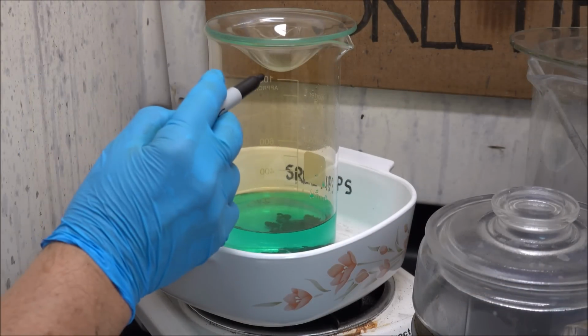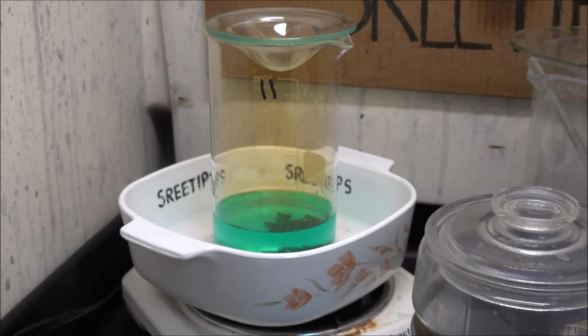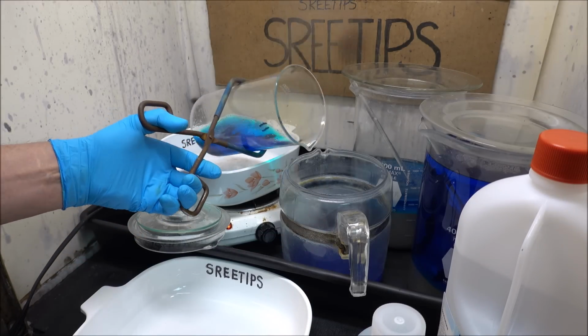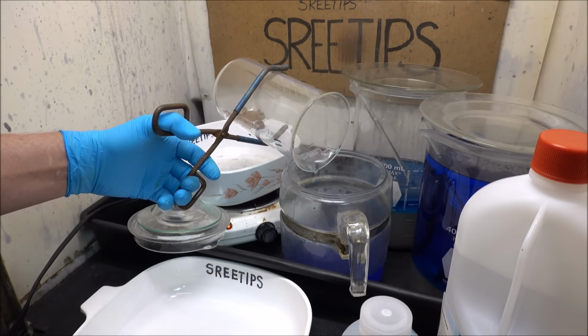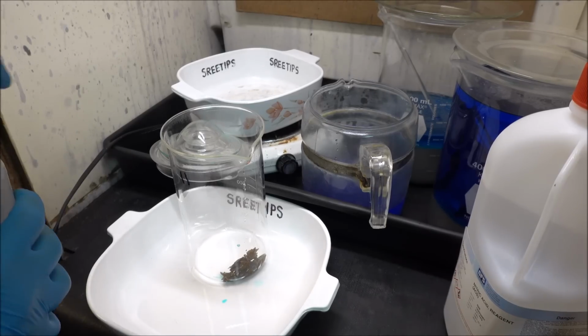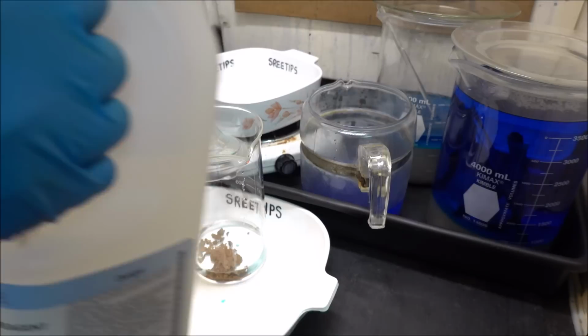This is the second hot dilute nitric treatment. So we got two now. This second nitric treatment was on there for about an hour. So I took it down, I emptied out the second treatment there, added some fresh reagents, and put it back on the heat for the third dilute nitric acid treatment.